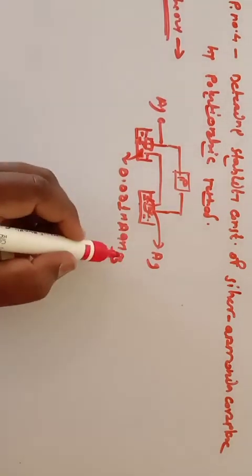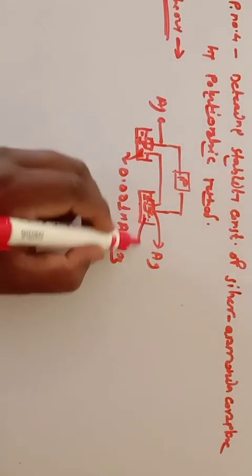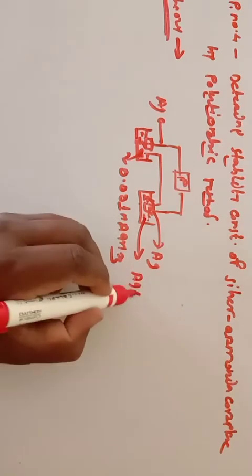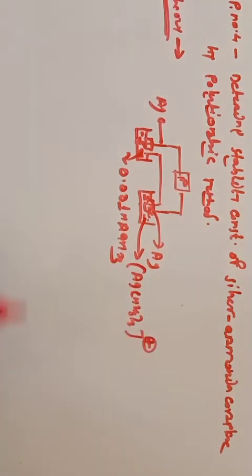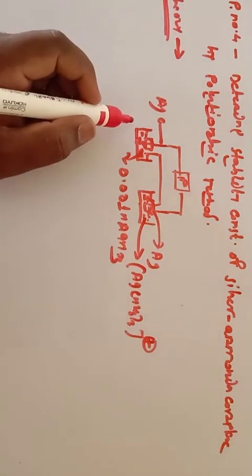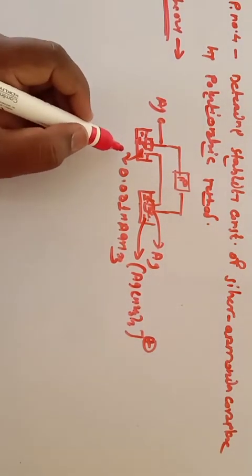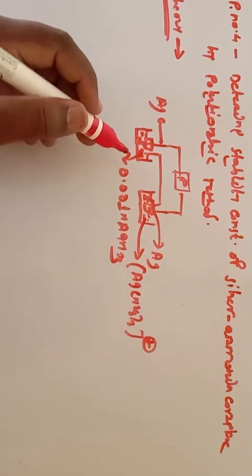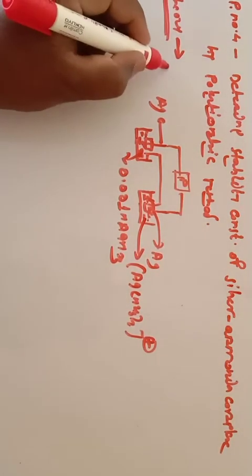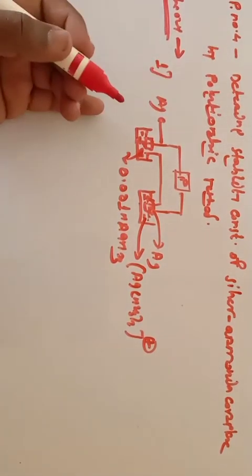This is also your silver electrode, and this solution is your silver ammonia complex solution. This is your AgNO3 solution. So you have to prepare the cell for whatever the concentration you have to prepare. So let's discuss the second point. So you have to prepare this cell, that is at one beaker.